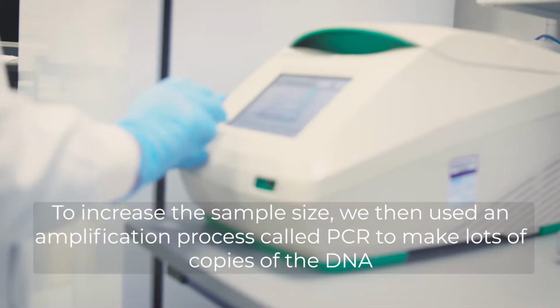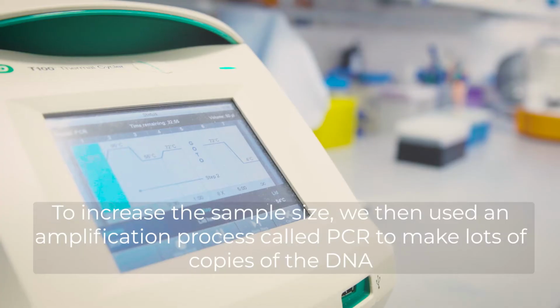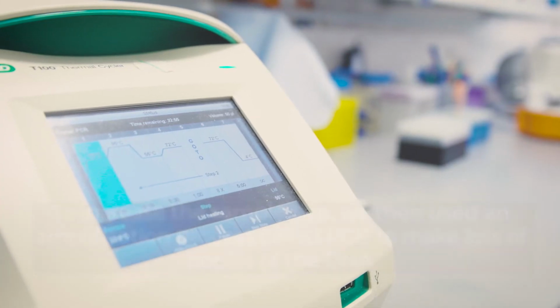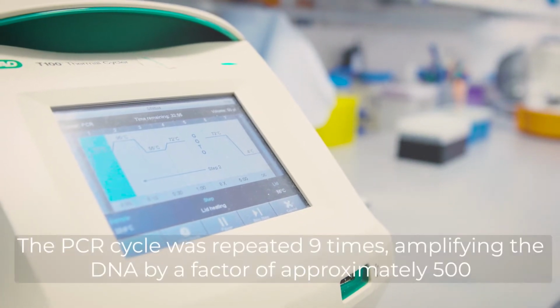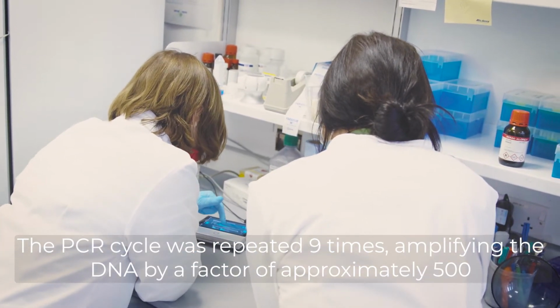To increase the sample size, we then used an amplification process called PCR to make lots of copies of the DNA. The PCR cycle was repeated 9 times, amplifying the DNA by a factor of approximately 500.